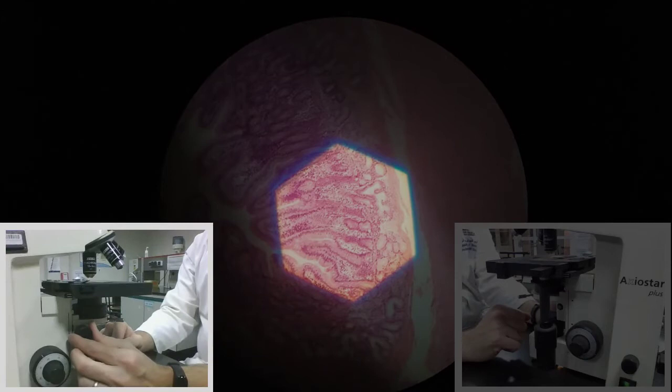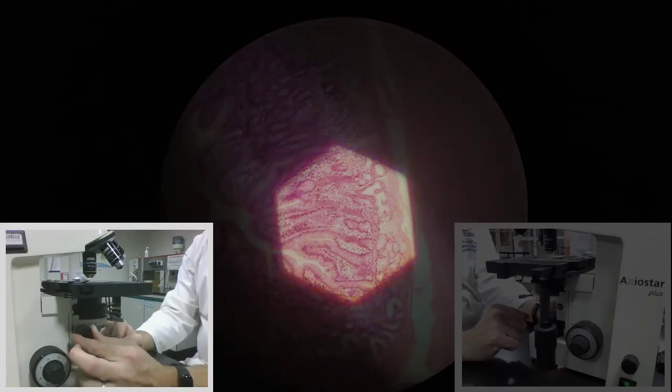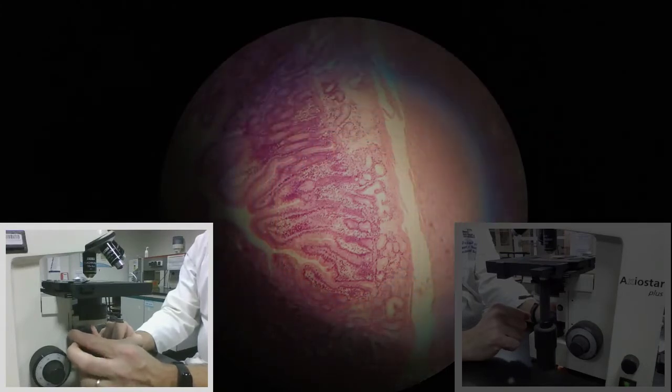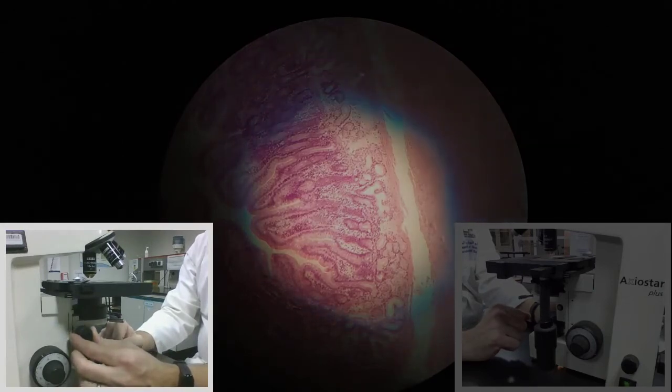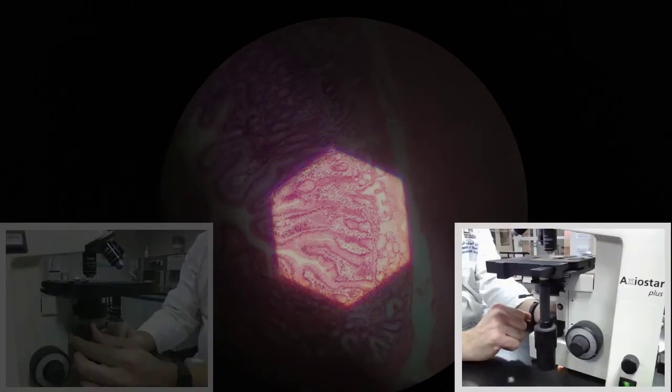The sharpness of those edges is controlled by the condenser focusing knob. So the condenser focusing knob allows me to get the condenser into focus. When it's out of focus, I'm going to use the condenser focusing knob to get it back into focus, turning it until I see sharp edges on this shape.